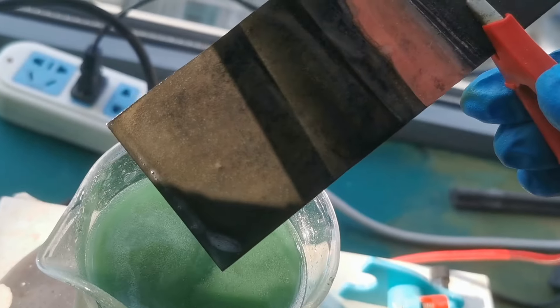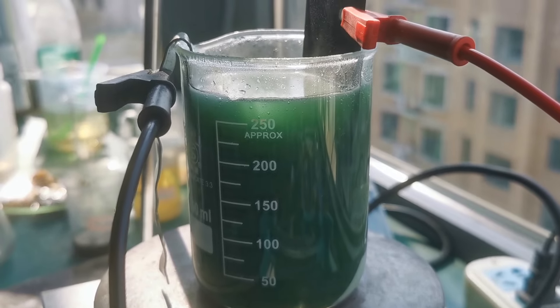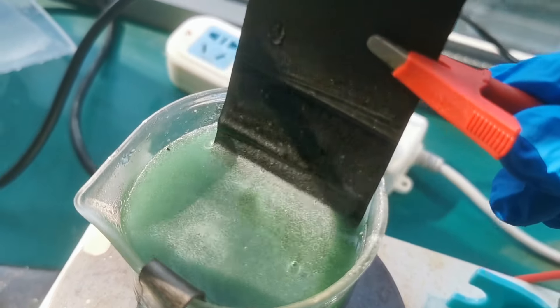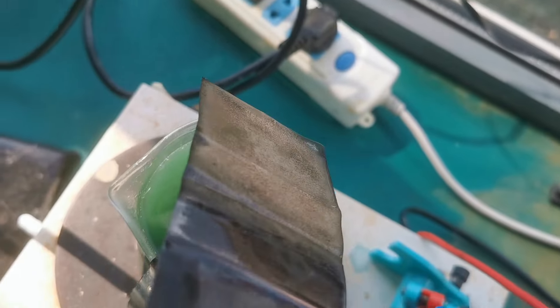I then decided to plate the rest of the exposed copper surface with nickel as well, just to prevent the copper substrate from oxidizing when it is in harsh corrosive conditions. Because the coating is just for corrosion prevention and not as an electrode material, I speedran the coating in 20 minutes, but I certainly regret this decision as the coating wasn't strong enough and partially flaked off afterwards.